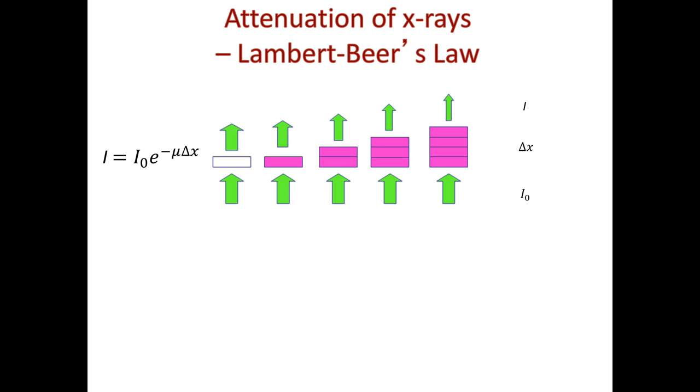Now, one thing that we have already learned is that if I filter different wavelengths or energies of the beam, if I have multiple energies comprising this incident beam, then some of them might react with the material differently. So whatever this portion of the material sees is different in nature, in the composition of the beam, than whatever this part sees. But I'm making this assumption when I'm reconstructing the image, and that's the source of error. So my model is overly simplified. Our models are always overly simplified. Sometimes it works better than other times. Okay? All right.